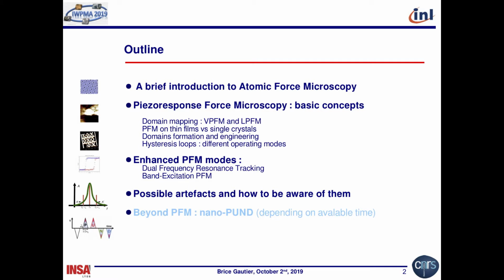And I will talk about hysteresis loops, so you don't move the tip and make a very local measurement of the polarization. I will quickly describe what is called now the enhanced PFM modes, namely the dual frequency resonance tracking or dual amplitude resonance tracking, which are most widely used now in the laboratories. And very, very shortly, the band excitation PFM.